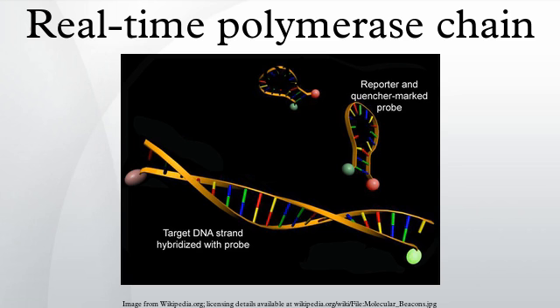The temperatures and the timings used for each cycle depend on a wide variety of parameters, such as the enzyme used to synthesize the DNA, the concentration of divalent ions and deoxyribonucleotides in the reaction, and the bonding temperature of the primers. Classification. The type of quantitative PCR technique used depends on the DNA sequence in the samples. The technique can either use non-specific fluorochromes or hybridization probes.